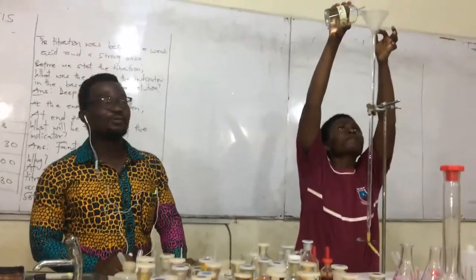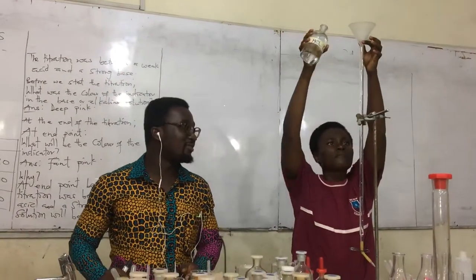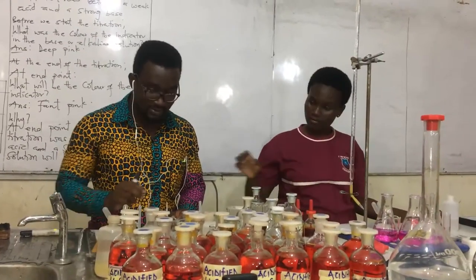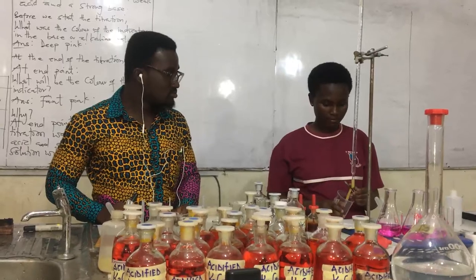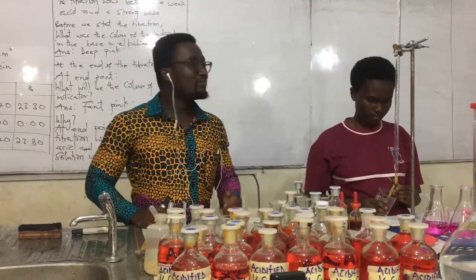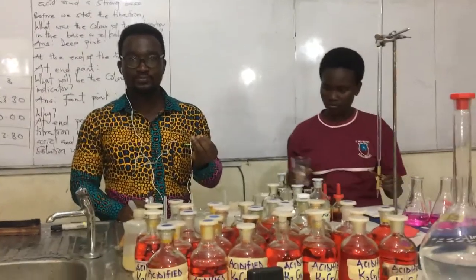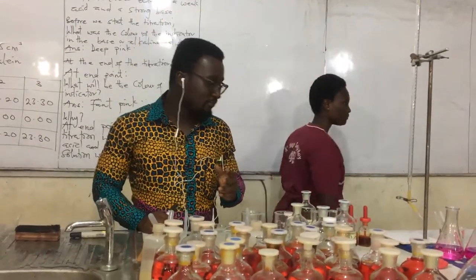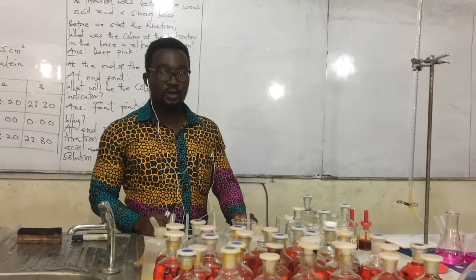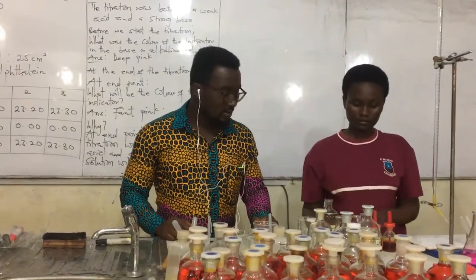So she's going to do the rinsing with a few centimeters of solution A. Now the purpose of this is to make sure that the inside of the burette is uniform with the solution that you are going to use. The inside of the burette must be uniform. Okay. So our madam is going to begin.